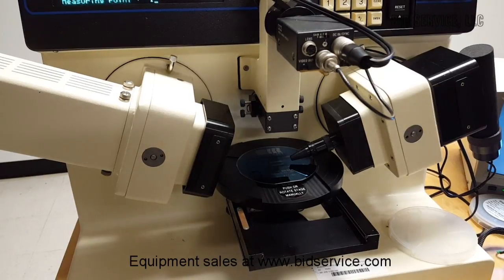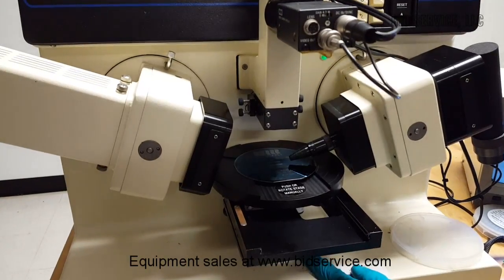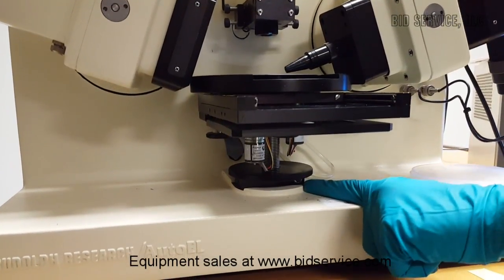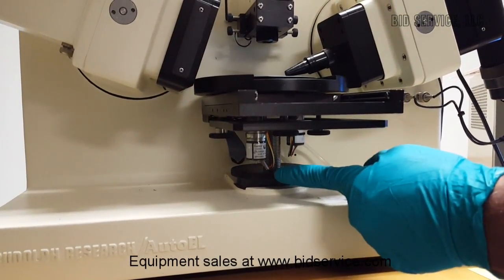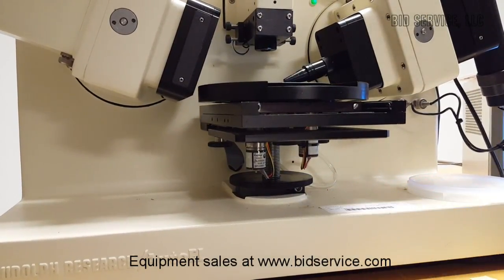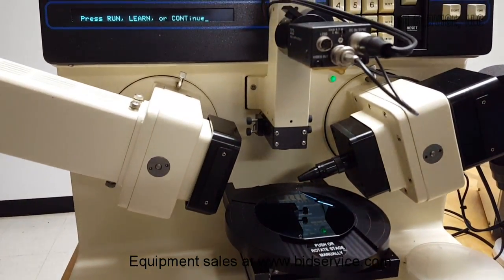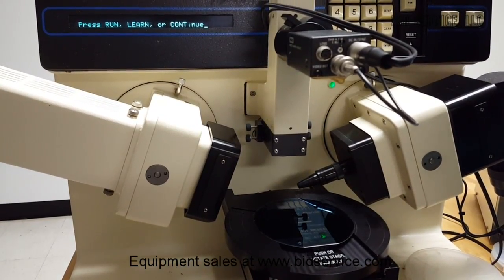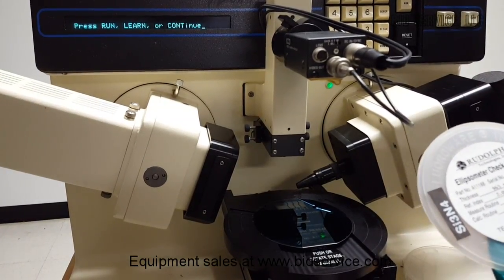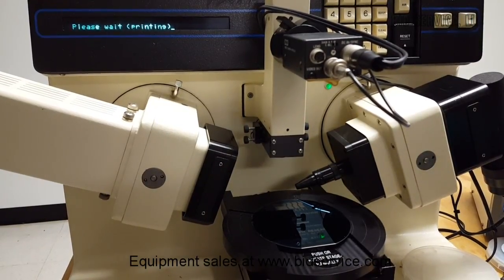To accommodate the variation in the thickness of the sample, there is an Allen screw underneath here, under this disc. This screw should be loosened and this knob should be rotated. Rotating it counterclockwise will lower the stage and clockwise will raise it. And while doing so, the thickness of the film is 963 angstroms and it measured 961 angstroms. Sometimes to repeat the measurement we can press continue.